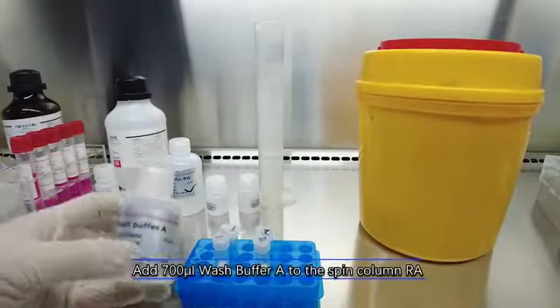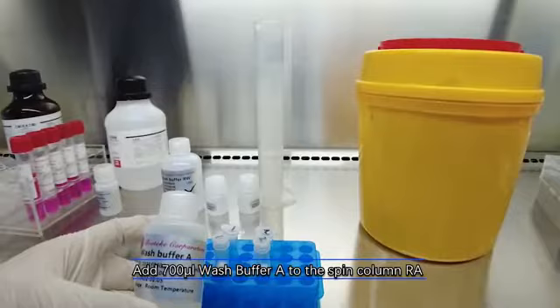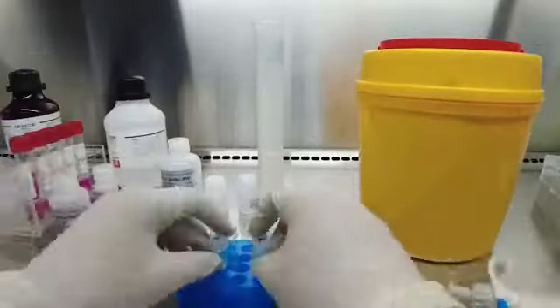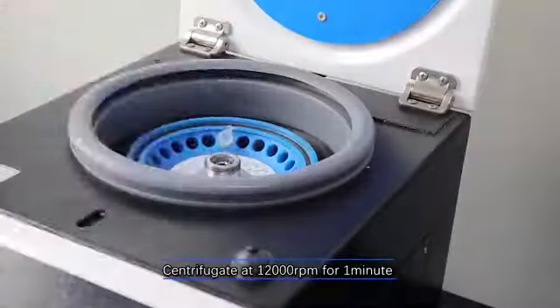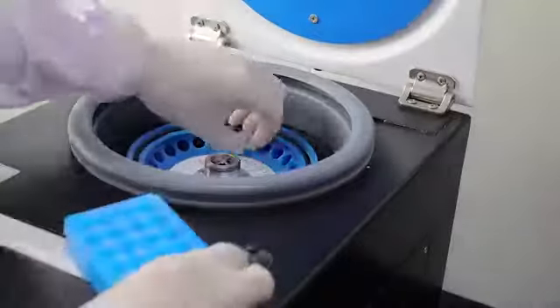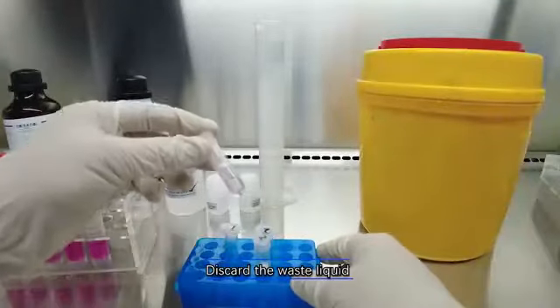Add 700 microliter wash buffer A to the spin column I. Centrifugate at 12,000 revolutions per minute for two minutes. Discard the waste liquid.